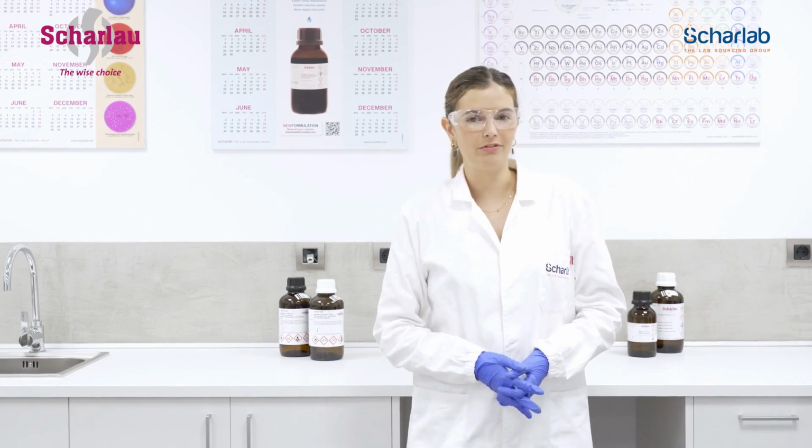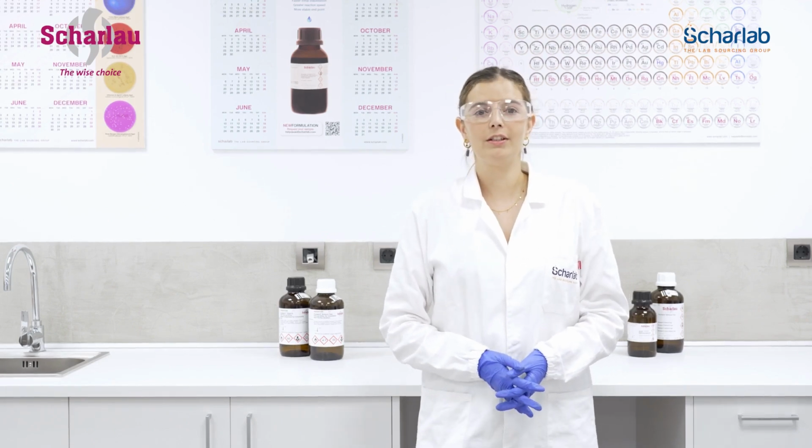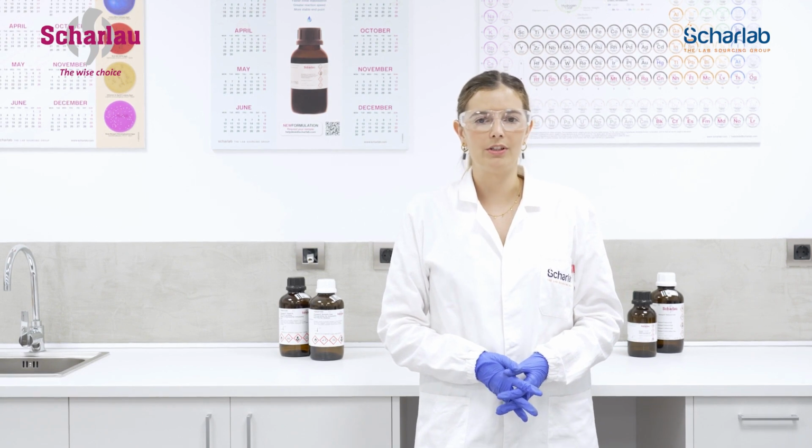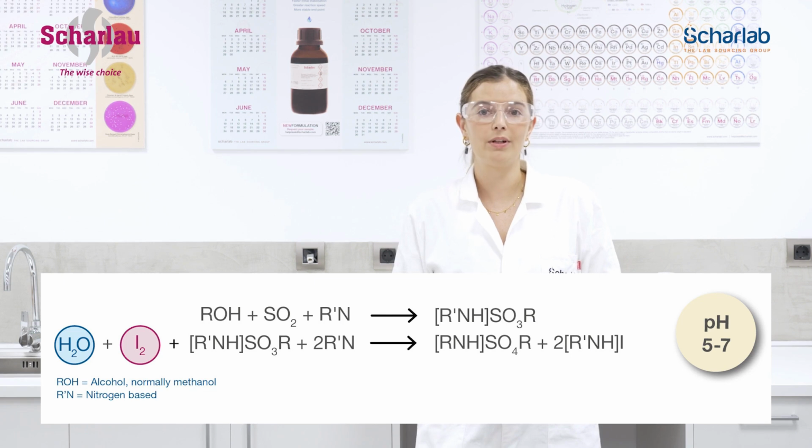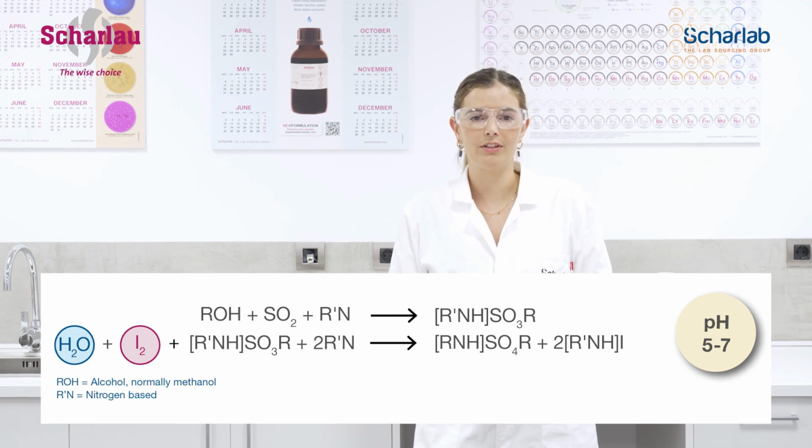Let's start with a bit of theory. Karl Fischer titration is the universally known technique for measuring water content. This reaction is what makes it possible, where there is a stoichiometric relationship between the iodine consumed and the amount of water in the sample.